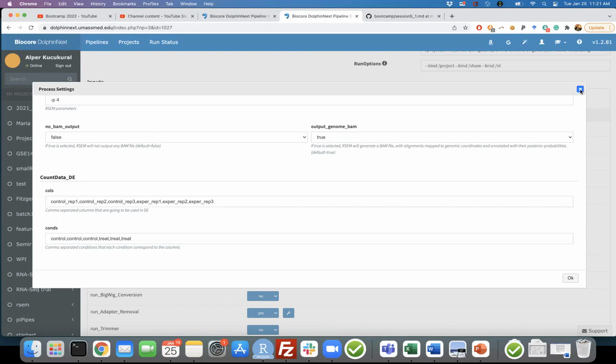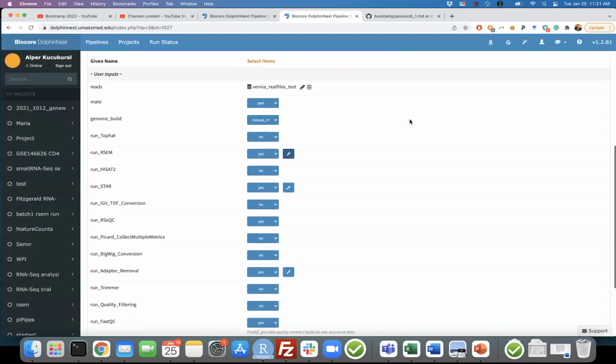You don't need to, but if you want to compare once, just to get a sense of it, I did that. Because whatever we put here, this kind of approach helps us compare different algorithms. You run all of them together with your own data. By the way, every data is different. Like when I say that maybe STAR is working on mouse better, it's because of some measures that I think are better, if I can define them. It's very hard to do that.